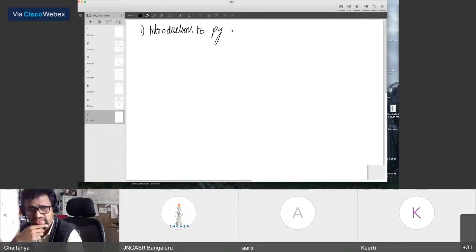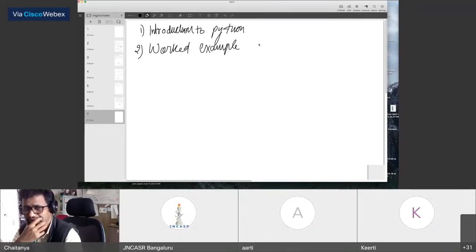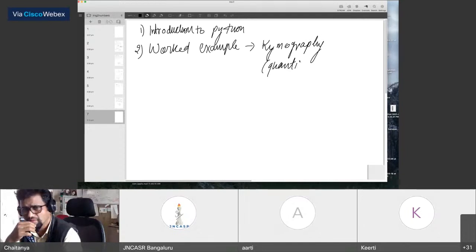Now, some of you did say that you already have used it before. And then we will continue with a worked example, which will be presented by Badir, of something called Kymography. And I think some of you already know what that is. But hopefully you will see a novel perspective, which is the quantification through tracking. Yeah?